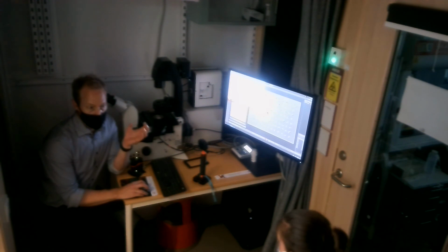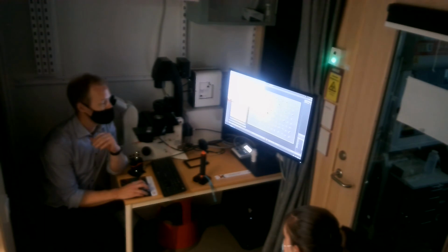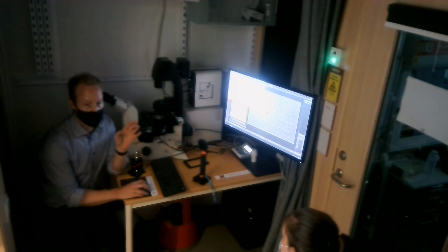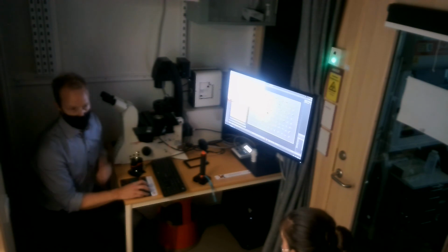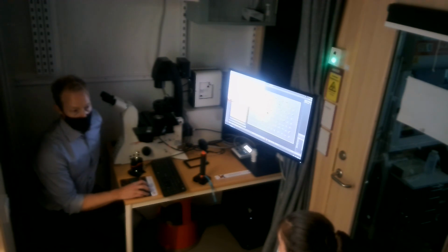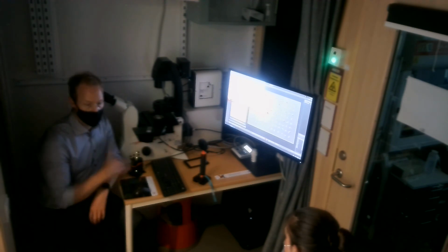Likely, when you've loaded it, redo the focus map with the new plate that is in there, and then you're good to go. So this is a way to quickly go from arriving here, putting your plate, loading this up, finding focus with the focus map, for example. If you're using autofocus instead, at least find the first focus so that you're not super far away, and then run.